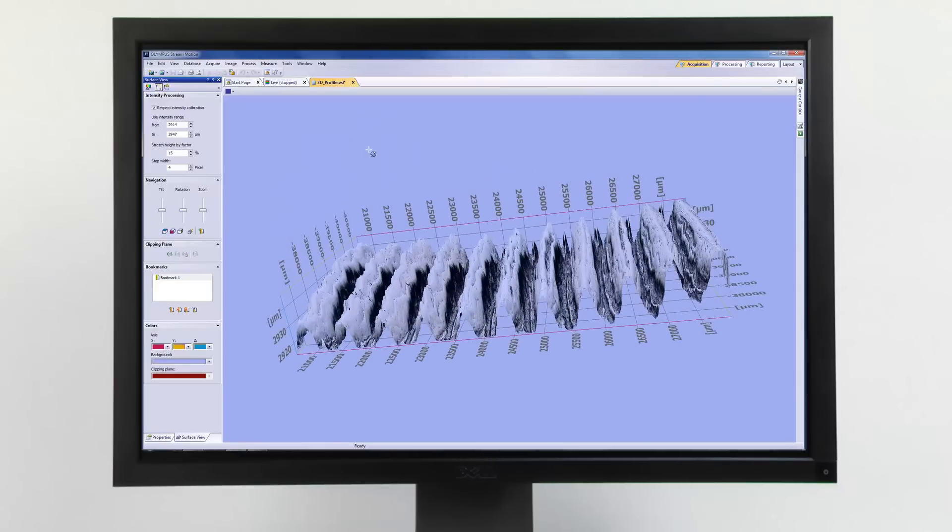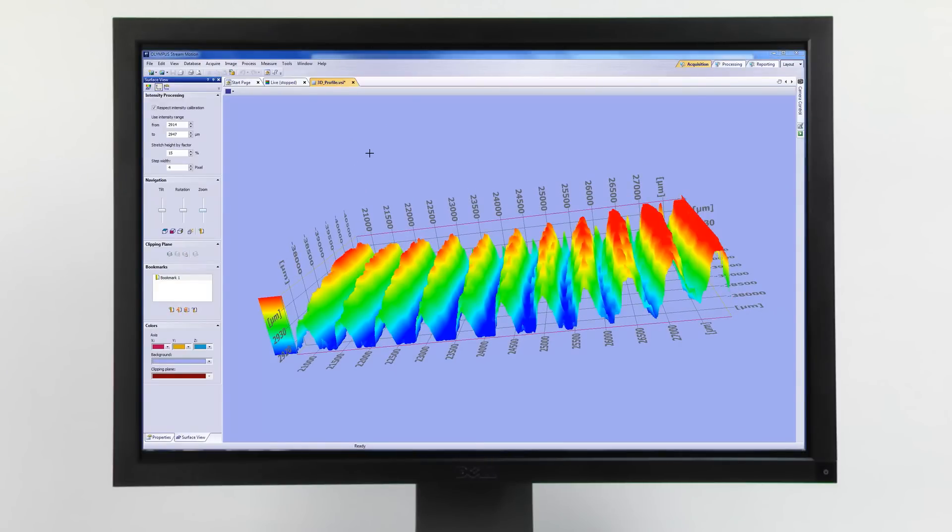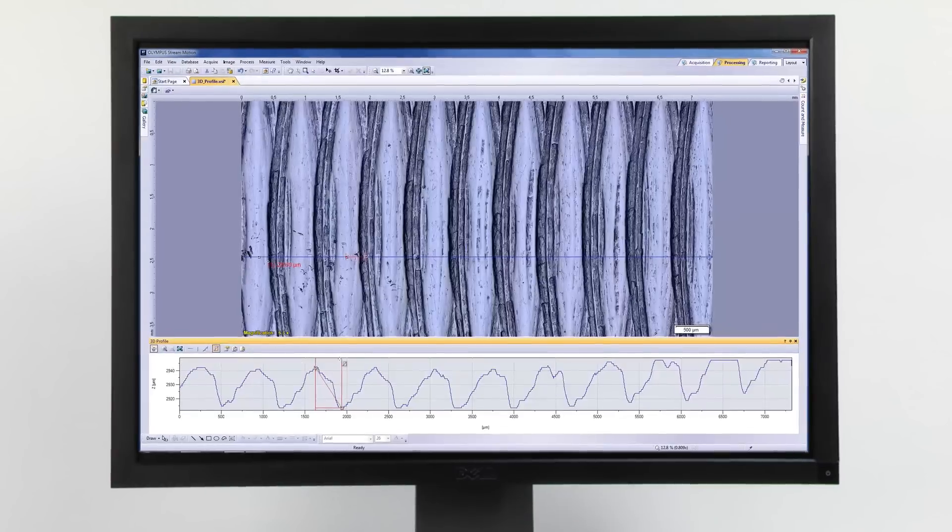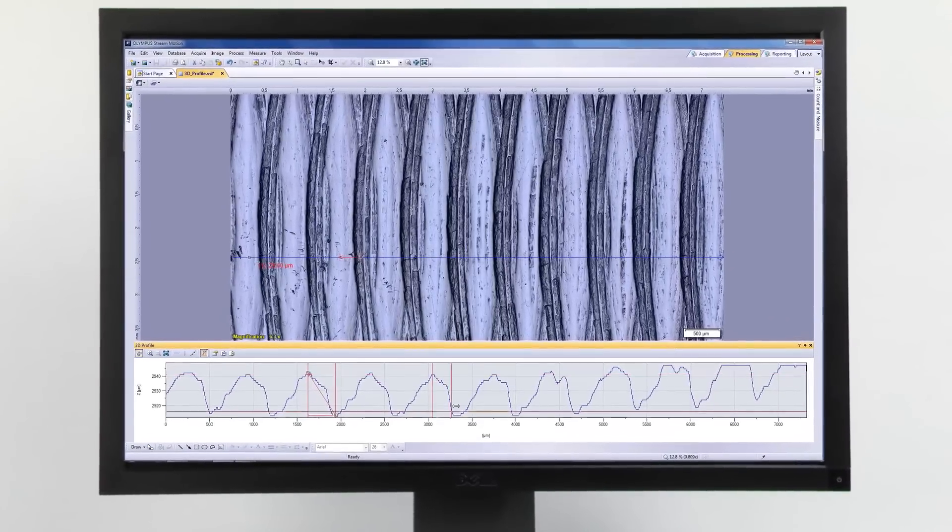This acquisition can be viewed as a 3D image at various angles and as a color map. When using a Z encoder, measurements can be performed on the profile.